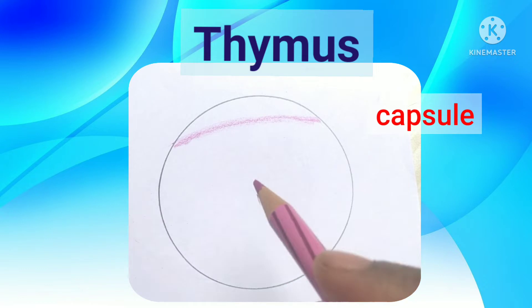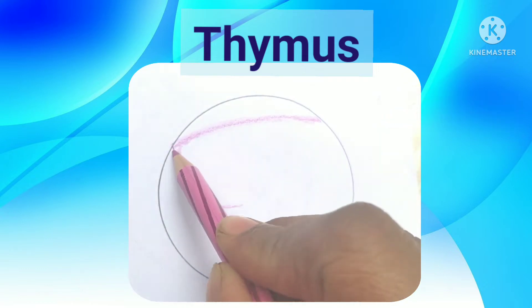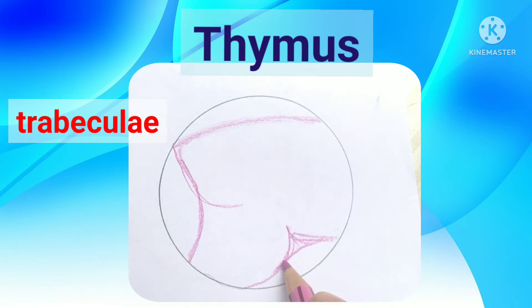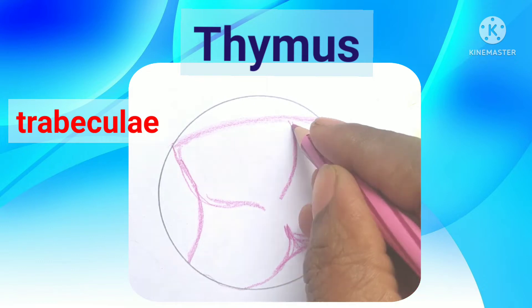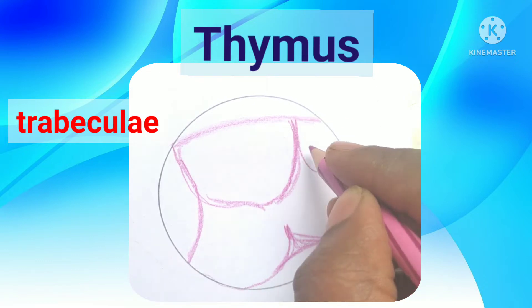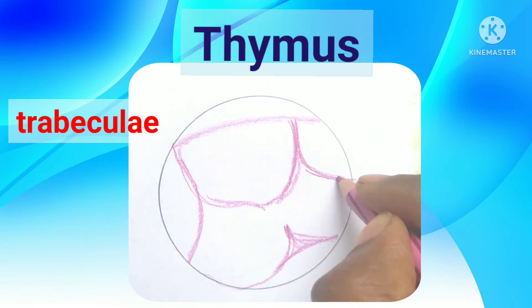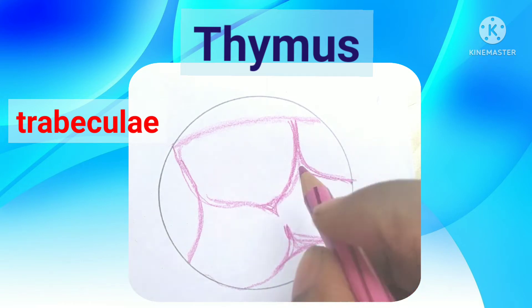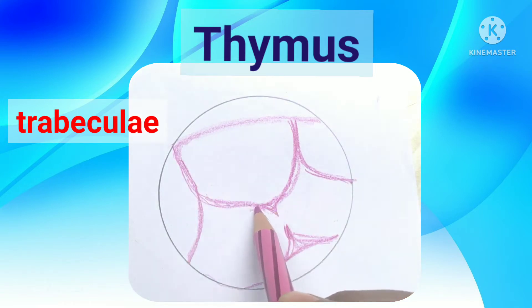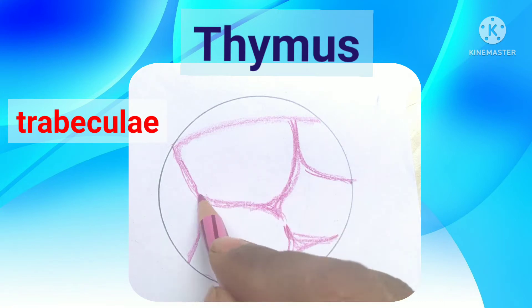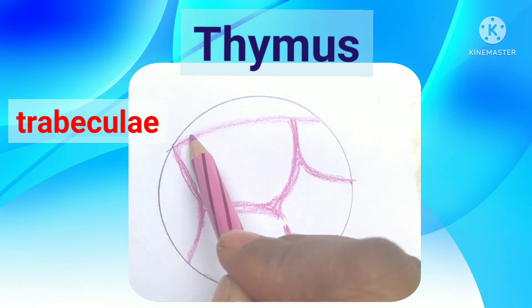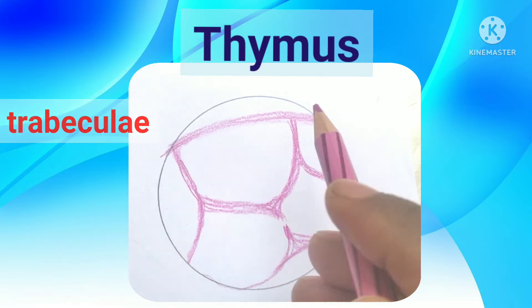The thymus is covered by a thin connective tissue capsule. The capsule sends septa inward called trabeculae, which divide the thymus into small lobules. The capsule and the trabeculae contain the blood vessels; the blood vessels don't enter into the lobules - they are present only in the trabeculae and the capsule.